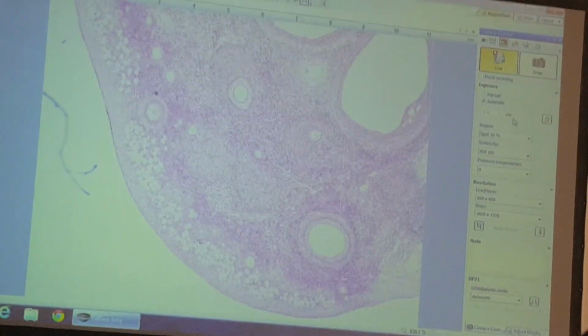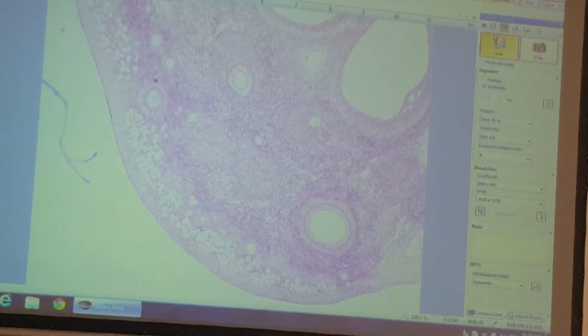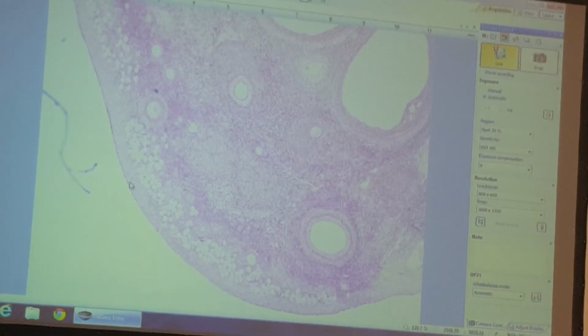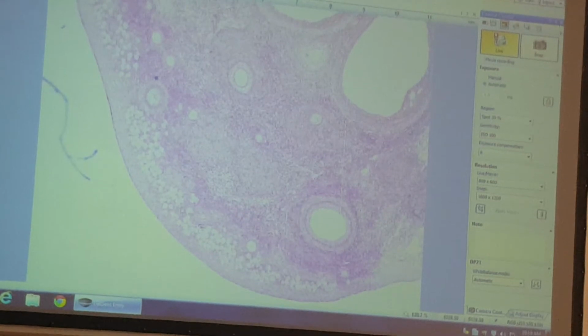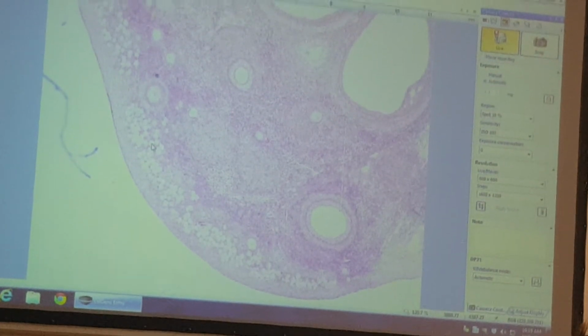Ovary, and I'm going to move it around quite a bit to show you everything in this one ovary. What we've got out here is the tunica albuginea, that connective tissue at the edge. And then all of these little tiny white circles right there, they're filling up this whole space right through here. All of those are primordial follicles. There's tons of primordial follicles.